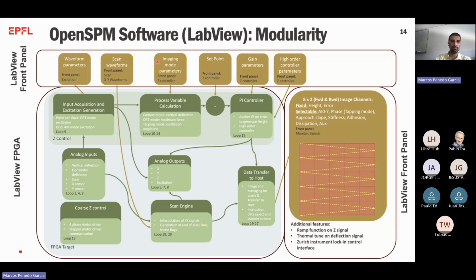And on the front panel, meaning on the computer side, it is the same. We have different kinds of windows for different things. So for the scan generation, for the scan control, like start the scan up, down, stop, pause. This is speed, this is point. So everything is in different compartments. We have different compartments for little scopes to check signals, and for the monitors to check images.